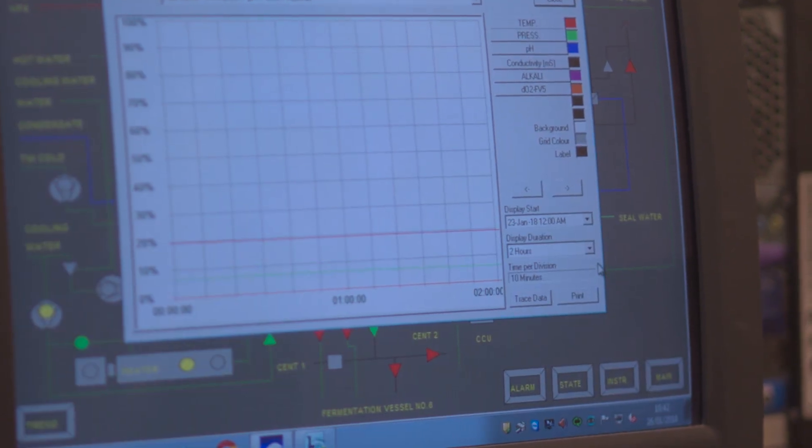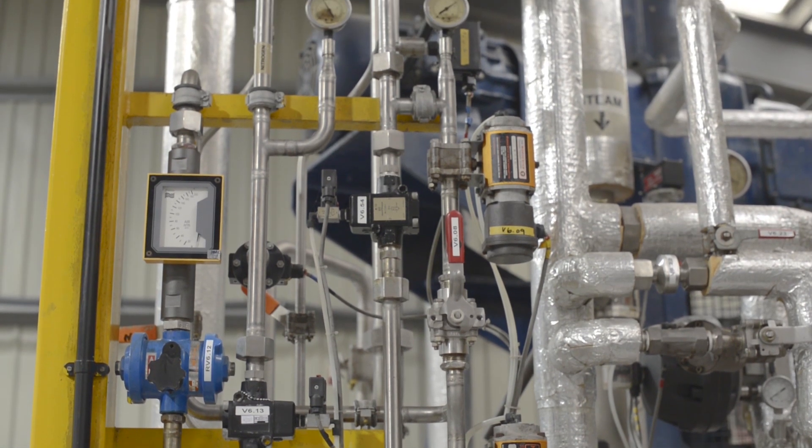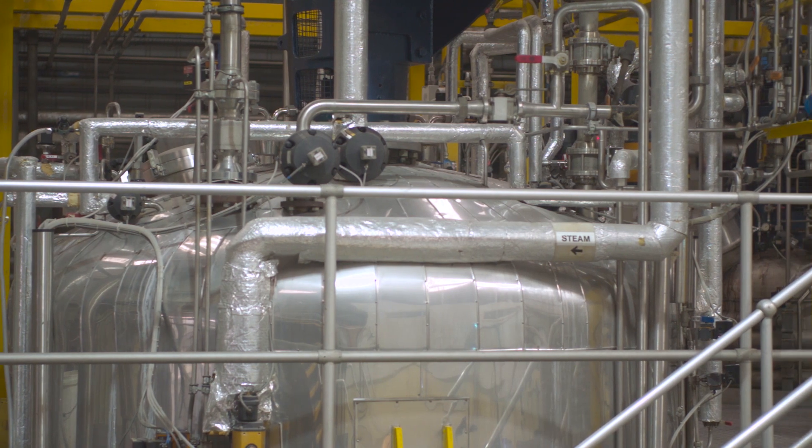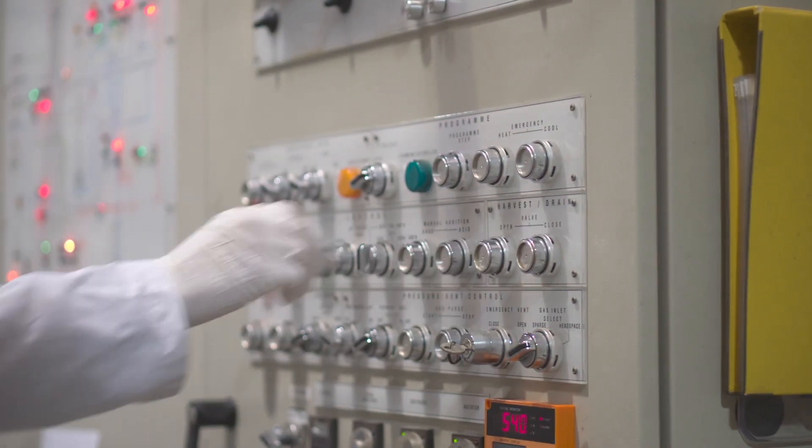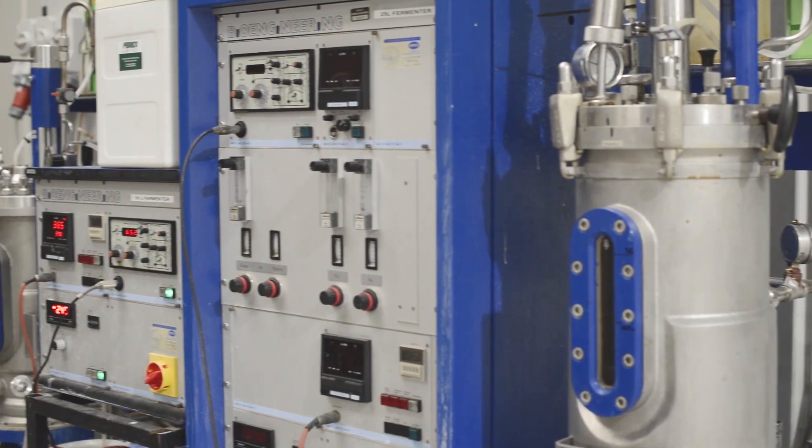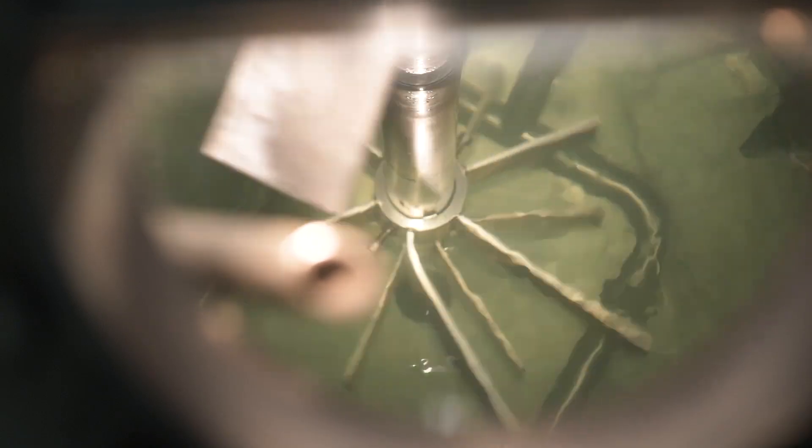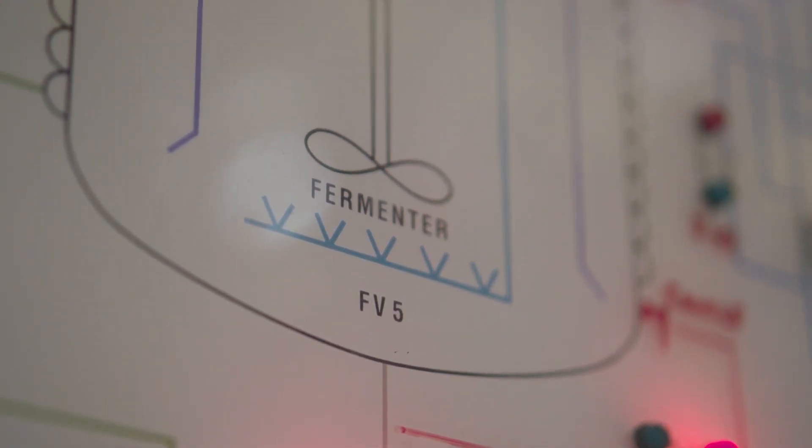When bacteria are at their optimal growth level, they are once again tested in the laboratory to ensure there is no contamination. The 10 liter seed fermentation is then used as the seed and transferred to the production scale fermenters ranging from 7 to 14,000 liters. Once the fermentation cycle is complete, the next stage in the production process requires us to separate the bacteria from the liquid growth media as gently as possible to ensure they are not stressed or damaged.